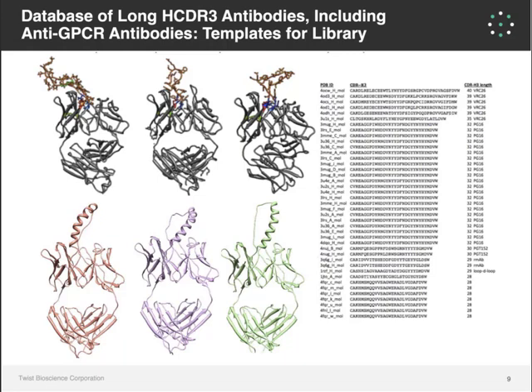And also we wanted to create a very long heavy chain CDR3, much like the bovine antibody example that I showed before, to enable that loop to insert itself into the GPCR and have function and potentially either activate or block that particular GPCR.